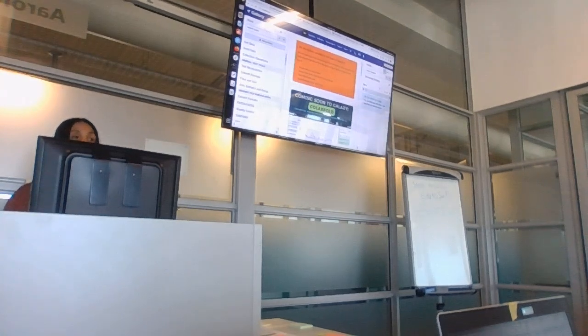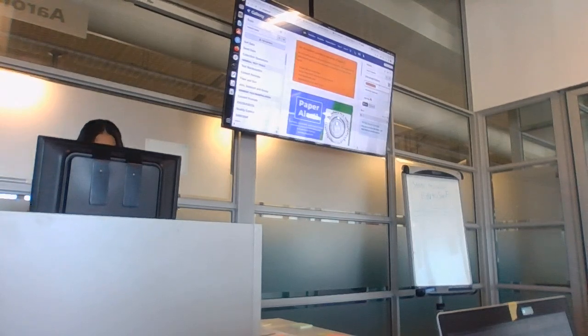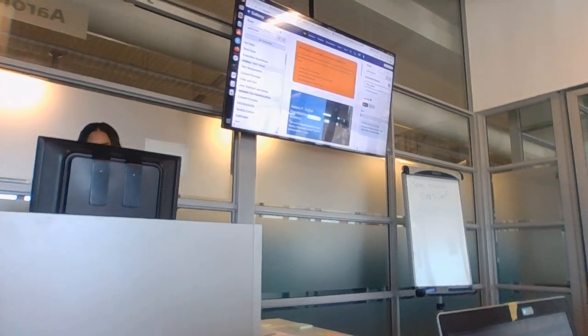Call it something intuitive. So these are cholera samples. So you could name it, remember, here by the edit, name it something intuitive like cholera data set. And remember, we use underscores or something to make sure that there are no spaces between the names.